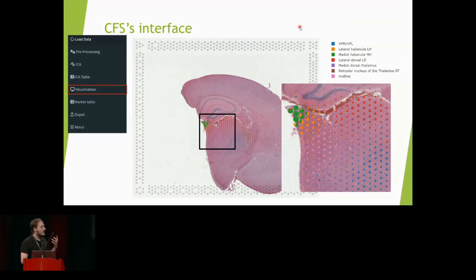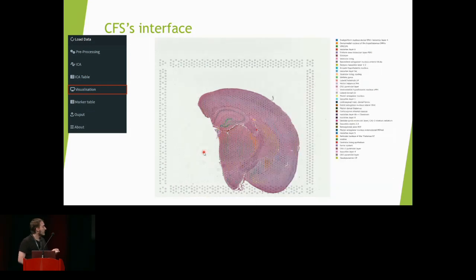With the tool, you can also display the density of each of the cell types across your samples. And also, you can generate scatterpie plots. Each of the scatterpies represents the IC signal, where the size of the pie chart represents the intensity of the signal overall, and each of the colors represents one of the ICs and the relative quantity between each of these ICs. You can also represent every single one of the ICs at once using the scatterpie chart.